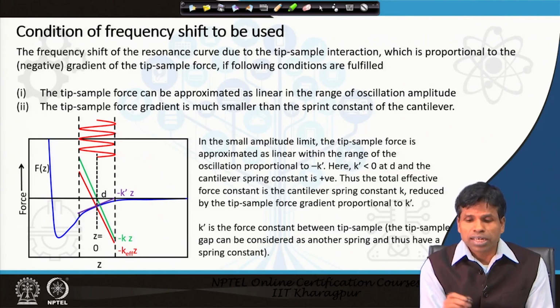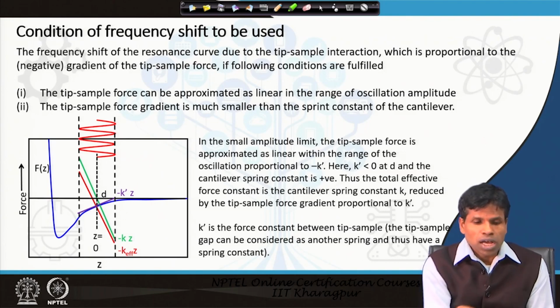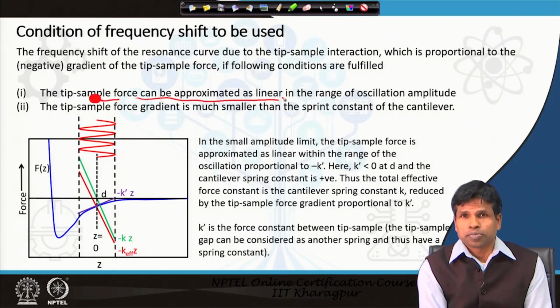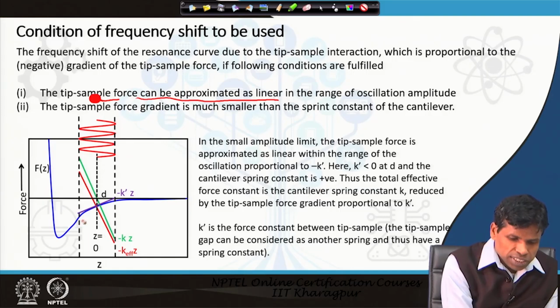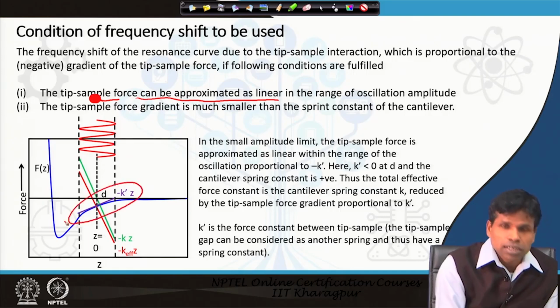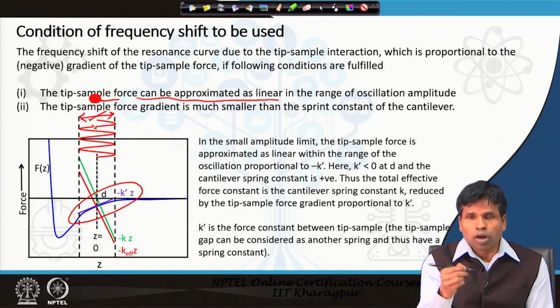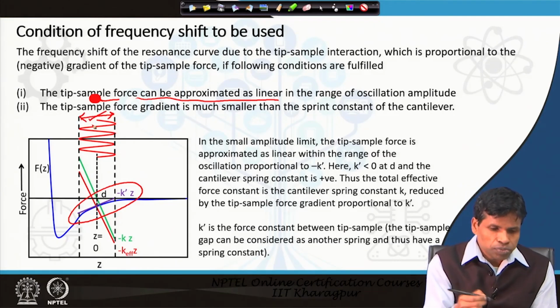Here, as you see, this is our attractive regime, and this is our oscillation amplitude.